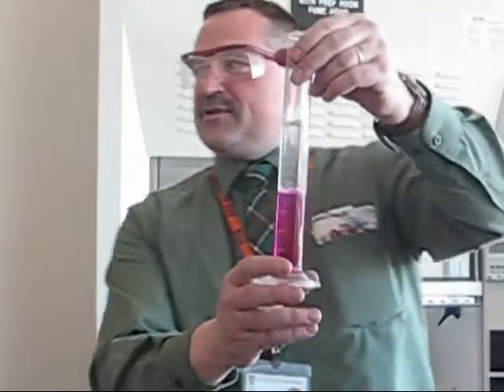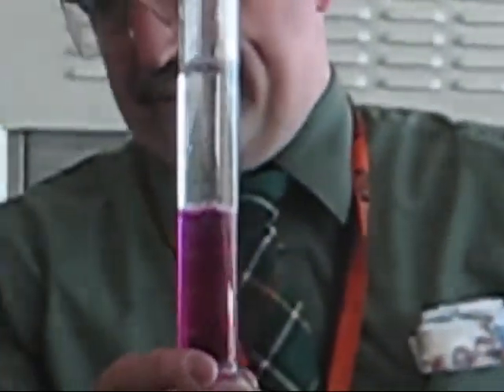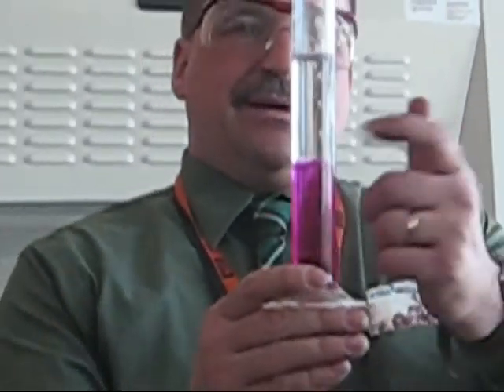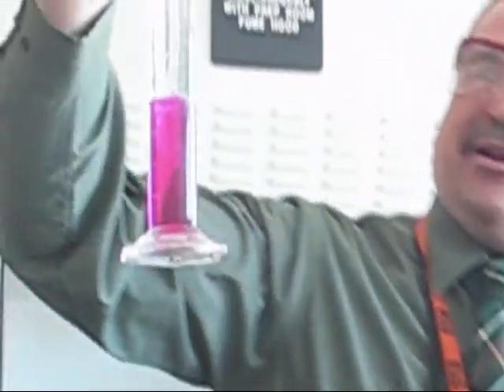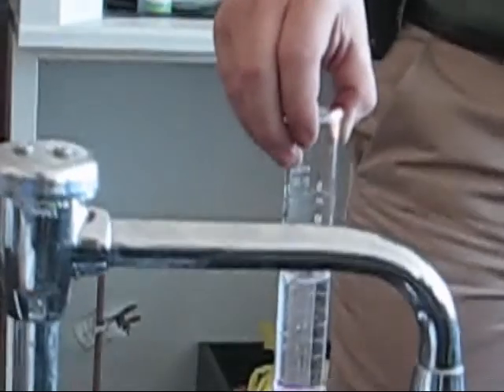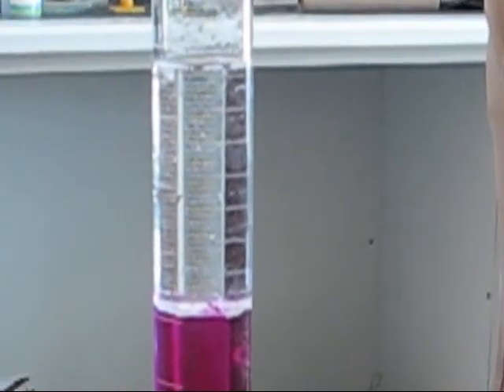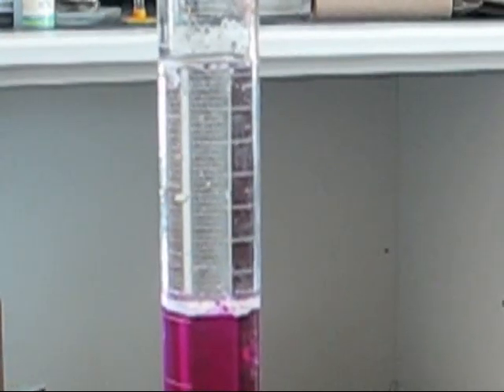Now, some of the more observant amongst us might have noticed a significant color change in the water. Oh, yeah. It was no longer pink, it's more now a fuchsia color. Well, all right, we won't debate the actual shade, but it's magenta. I don't know. Anyway, fluorescent something. Anyway, so that's just a little thingy there that we can do. There goes sodium. Yep, I got to put that tiger back in his cage there.